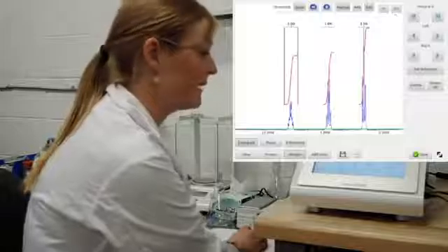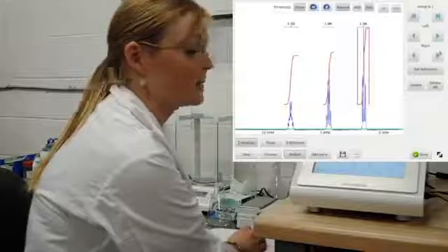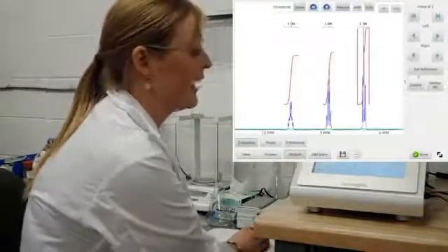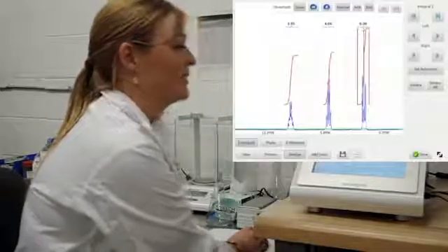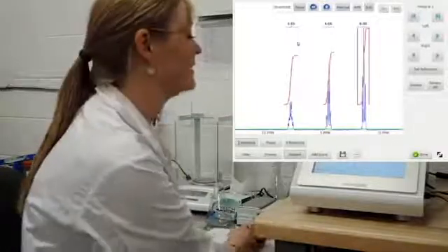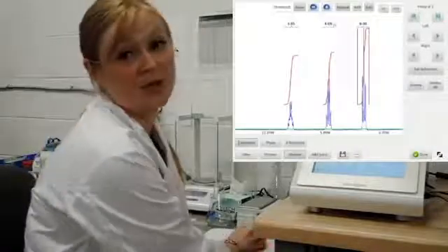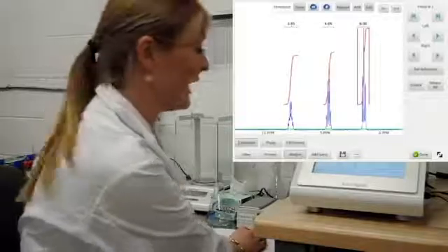If I select the edit button, I can jump back and forth between my integrals, and then I use these for fine adjustments to the bounds of each integral. This is diethyl phthalate. I have 2 methyl groups, so I'm going to set this reference to 6. I get an integration of 6 to 4 to 3.8, which is approximately the 6 to 4 to 4 that I would expect. If you want a more accurate, quantitative integration, you would choose a longer scan delay than I have, so more of the aromatic protons can relax.